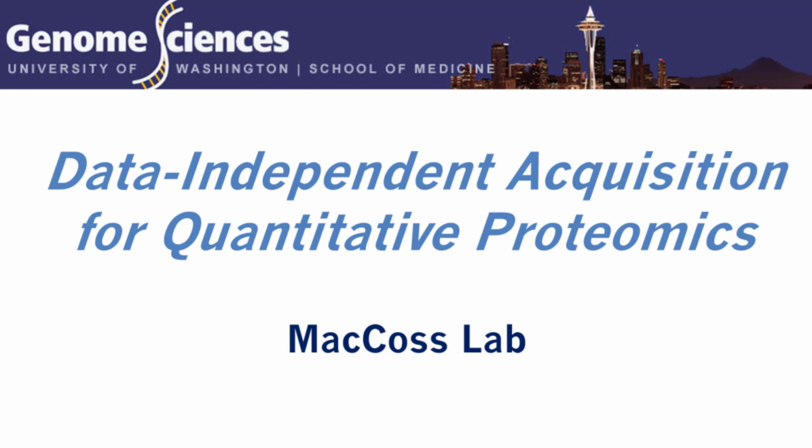Okay, so I want to give you a little bit of thoughts on how we think about data independent acquisition, and how we think about it in the context of doing quantitative proteomics. And as Brian mentioned, our lab has gone all in for this. I'll also point out that we started doing data independent acquisition in about 2004. We collected this data in our lab, and it took a lot of time for both the hardware and the ideas and the methodology to catch up with this.